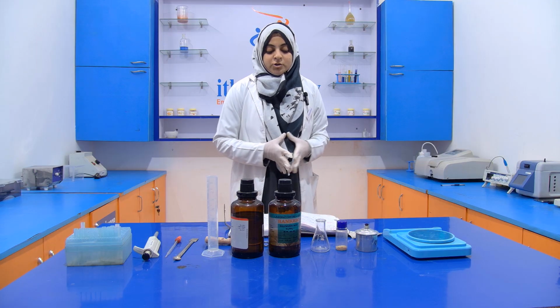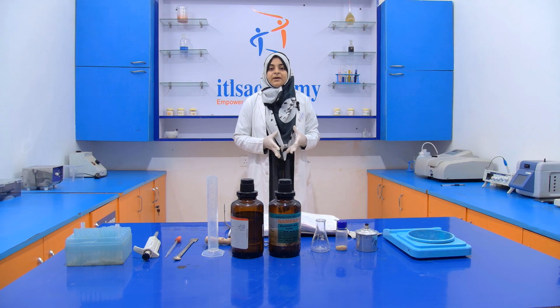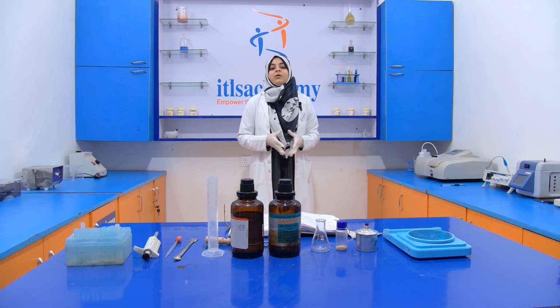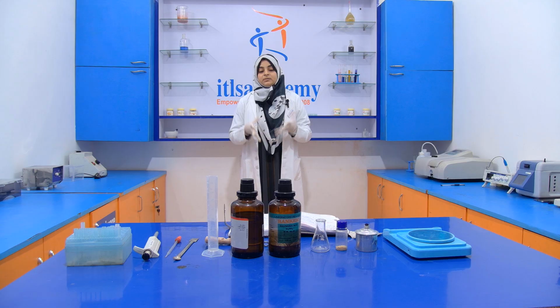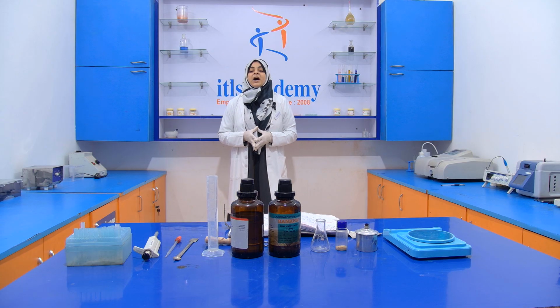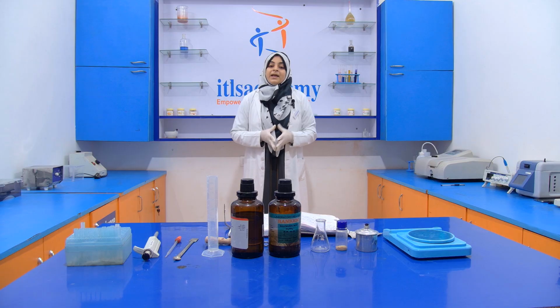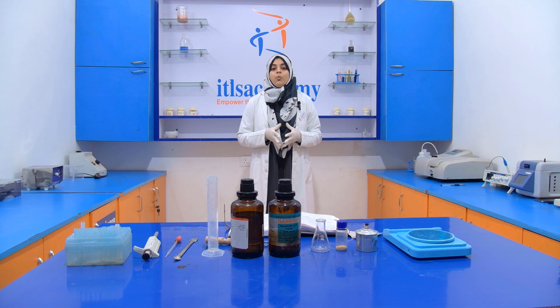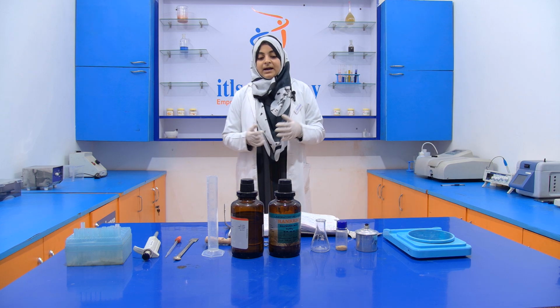Now, why is it important to detect colophony residue in asafoetida? Colophony residue is carcinogenic, which means that it has the capability to cause cancer in human beings. And you know that cancer is a very dangerous health issue among human beings. That's why it is very important to detect it. Now, let's start the experiment.